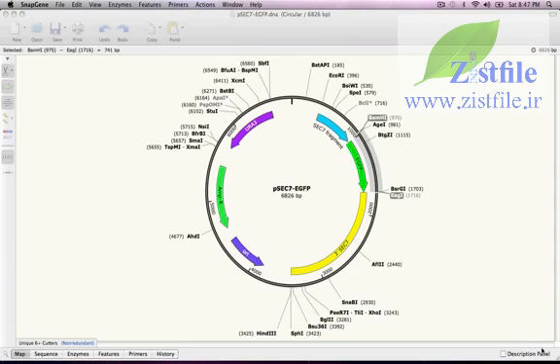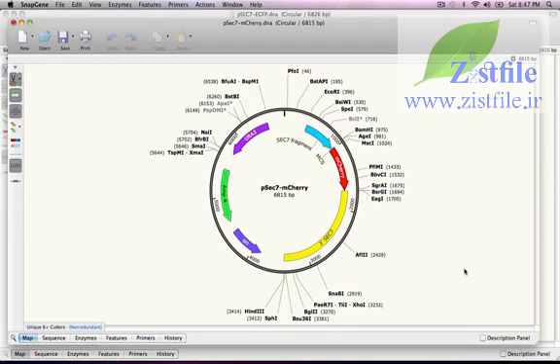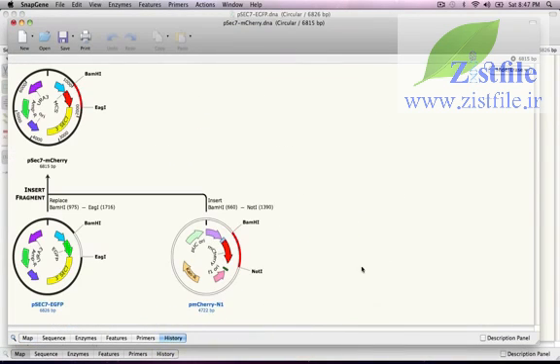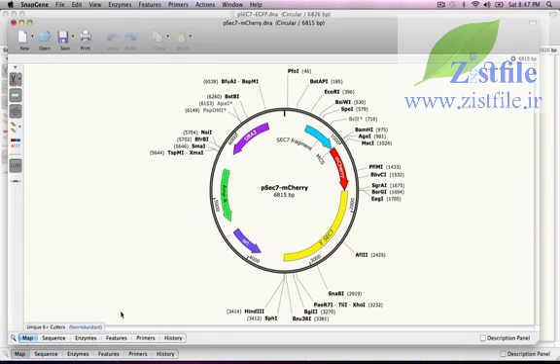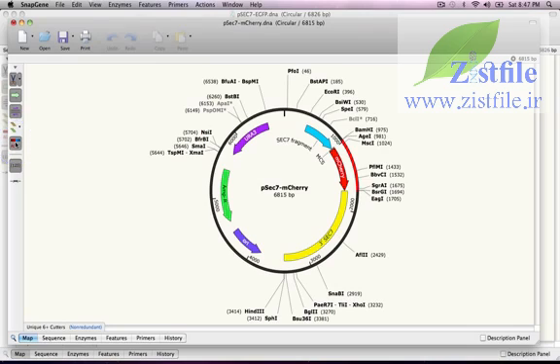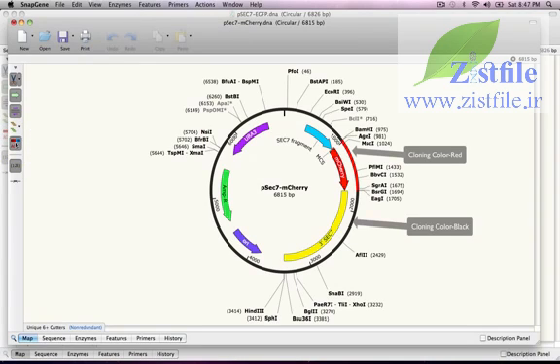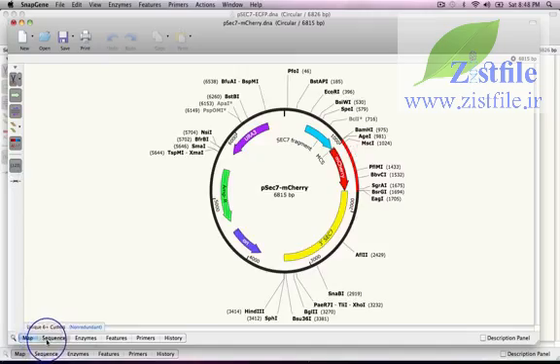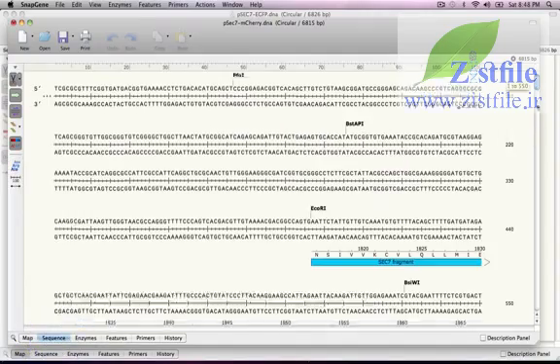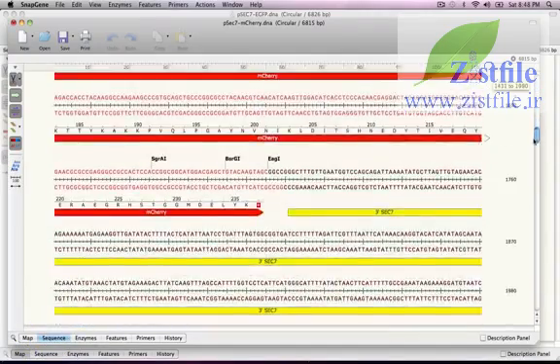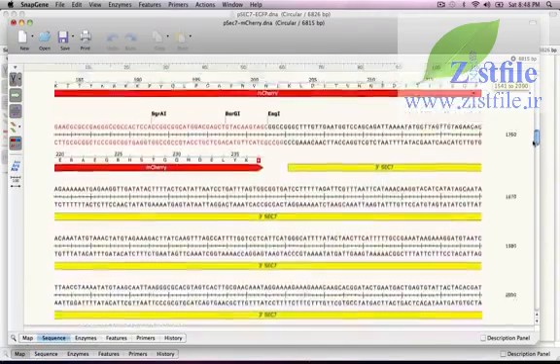Now when I press Clone, I generate the product. Clicking on the History tab shows the operation that I just performed with the same colors that were used in the cloning window. If I click on the Map tab, I can press this button in the side toolbar to turn on those same history colors. When I switch to Sequence View and scroll down, the history colors show me exactly where the insertion occurred.